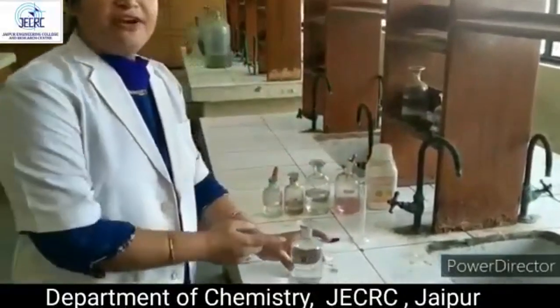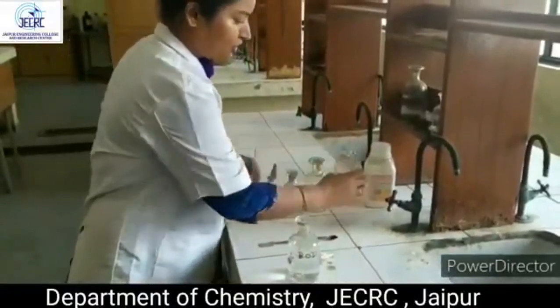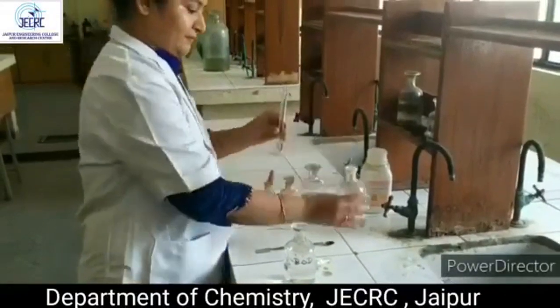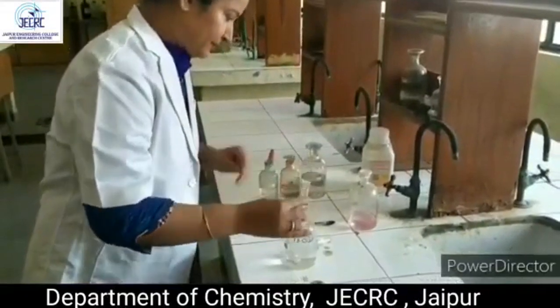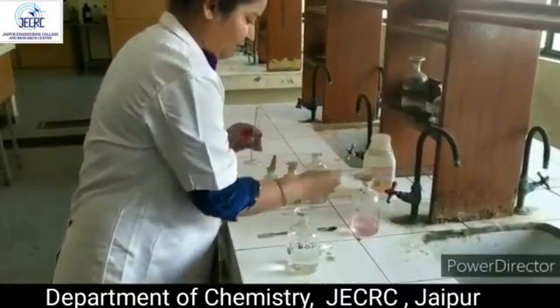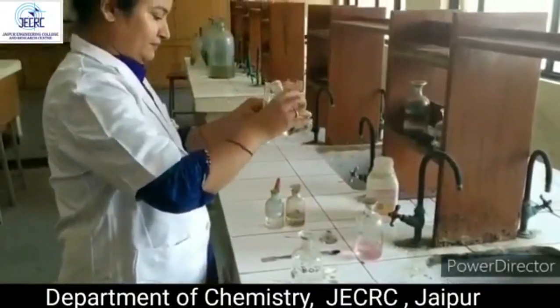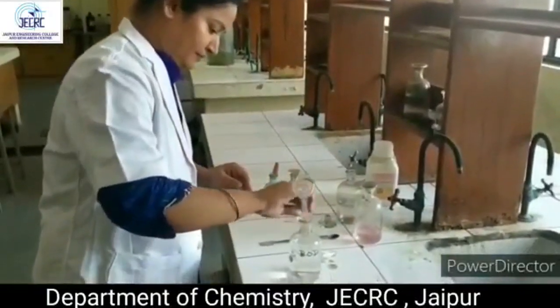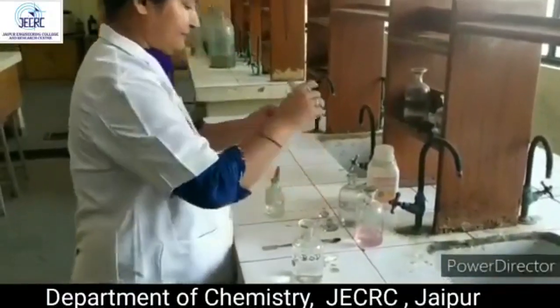Now, in this 300 ml water sample, we will take 1 ml of these solutions: 1 ml manganese sulfate, 1 ml KI solution, 1 ml azide, sodium azide.